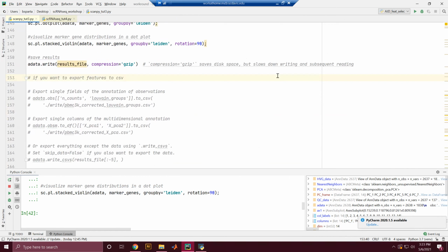But overall, I think I presented a lot of commands to you, but if you go through this slowly and follow along with your data or the ScanPy website, it's pretty easy to use as long as you have some informed understanding about what each of the functions do to your data and how you might want to modify some of the inputs, like, for example, adjusting the clustering resolution parameter.